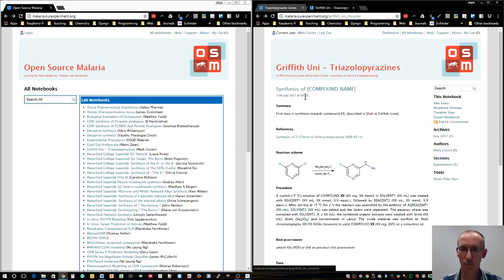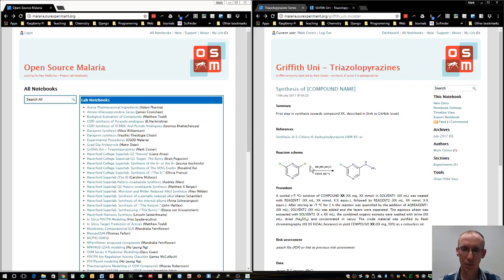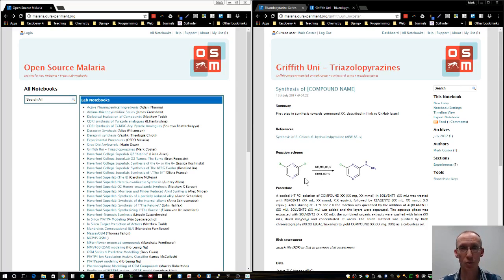Then it's really important in chemistry to have a picture that shows you the synthetic steps, a reaction scheme.